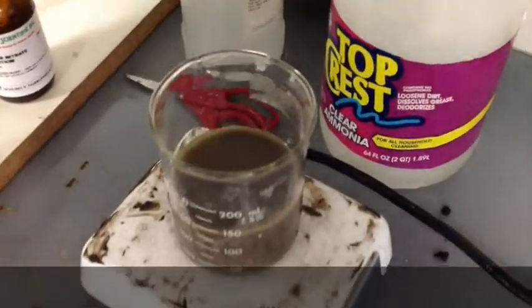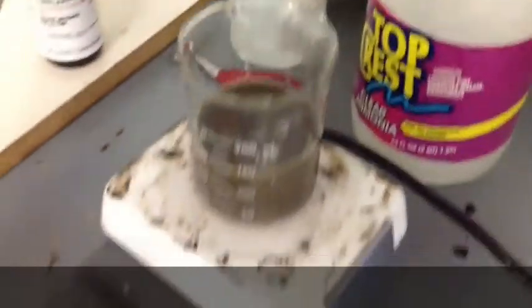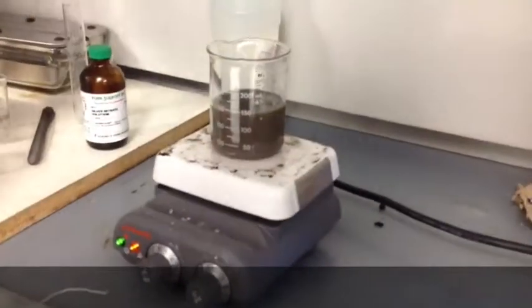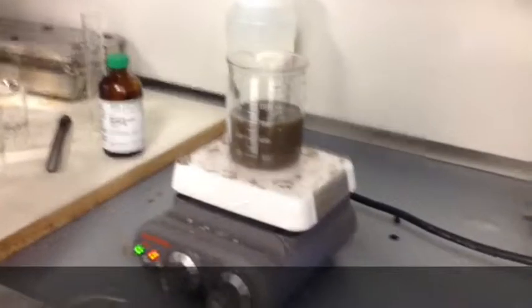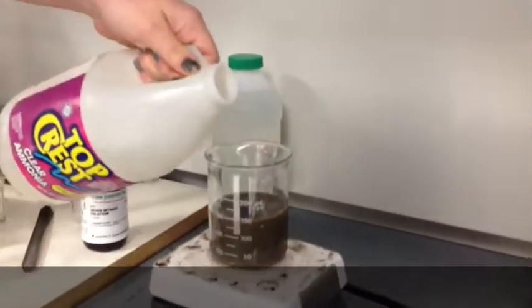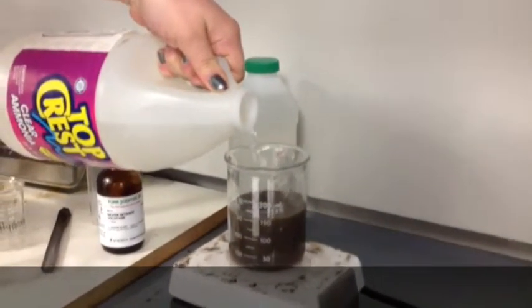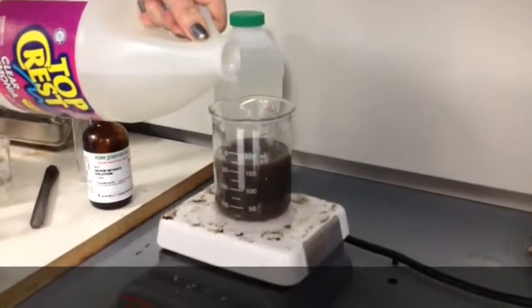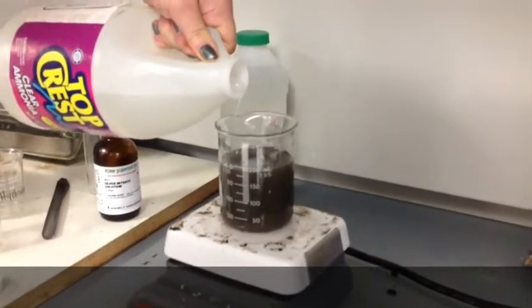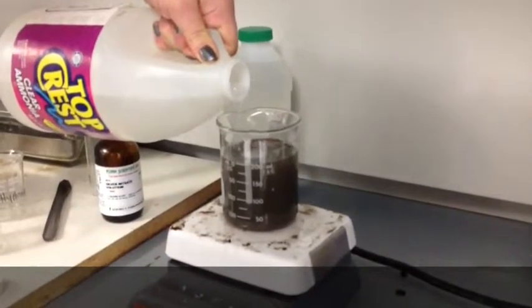Next, you want to add ammonia. When you add the ammonia, you just want to add enough so that the solution turns back to clear. As I'm adding this, just watch the beaker and you'll see what I mean in just a moment. There's a pipette in there — you can see that poking out.